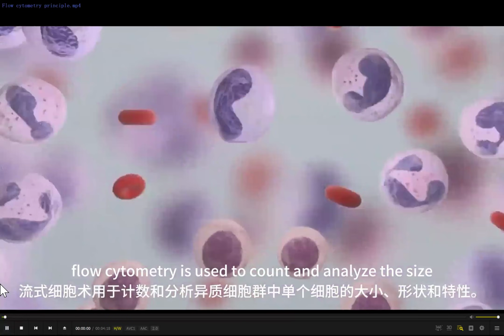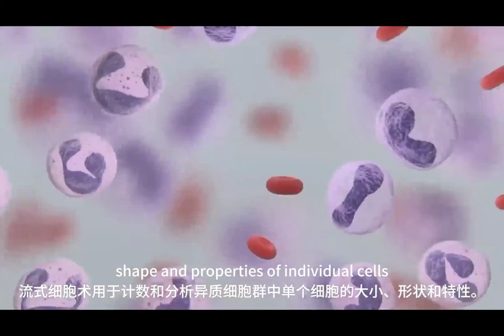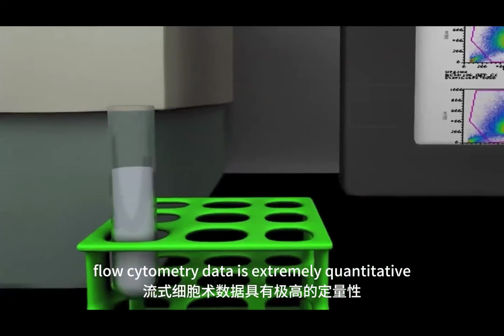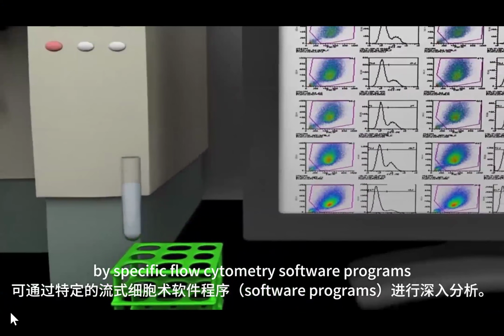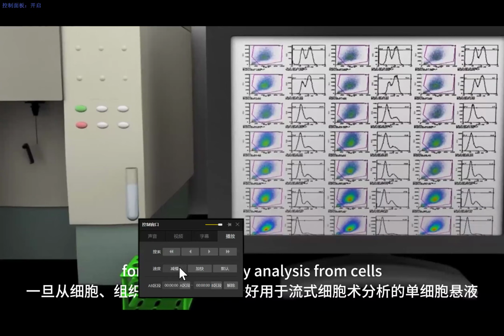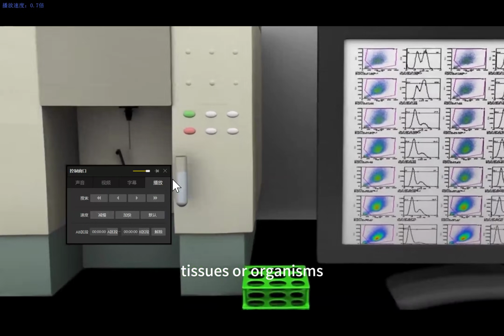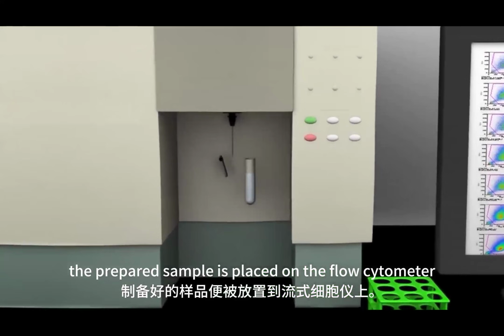Flow cytometry is used to count and analyze the size, shape, and properties of individual cells within a heterogeneous population of cells. Flow cytometry data is extremely quantitative and can be analyzed in depth by specific flow cytometry software programs. Once a suspension of individual cells has been prepared for flow cytometry analysis from cells, tissues, or organisms, the prepared sample is placed on the flow cytometer.